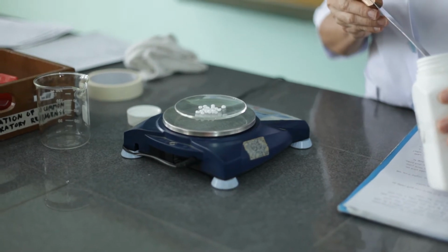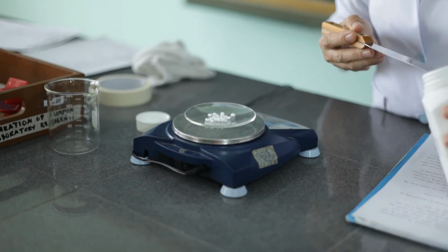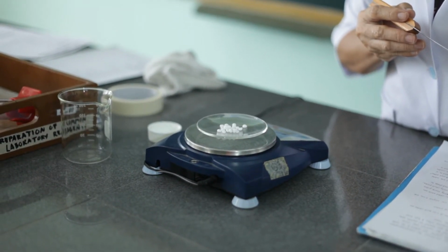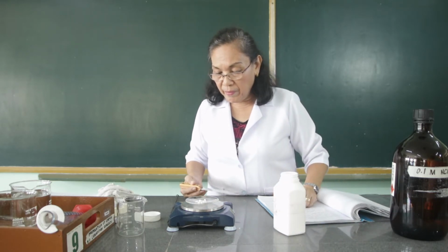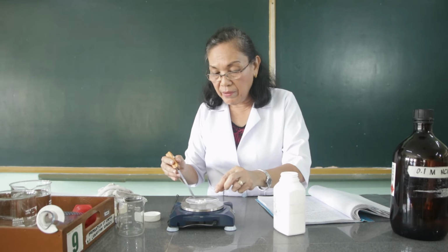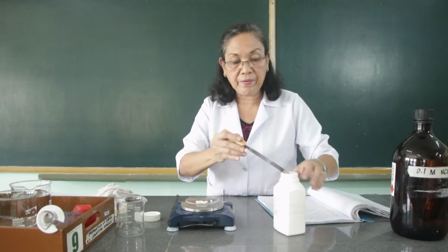.58, so that's it. 5, 4, 5, 5, 5, 3, so one more pellet. Just one more. 5, 9, 6, 5. 6. We'll just remove a little, one little piece. Okay, that would be enough.